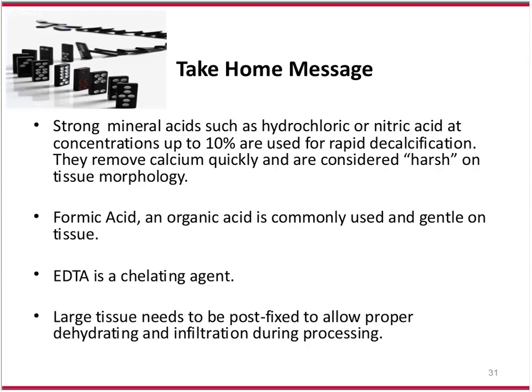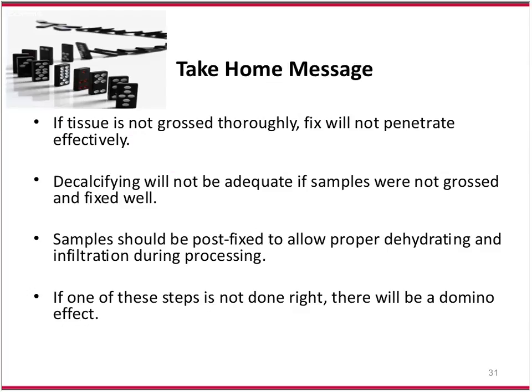Large tissue needs to be post-fixed to allow proper dehydration and infiltration during processing. I'm going to say all tissue in my lab, but in your lab you may only want to do the large tissue, or maybe you don't want to do any. I've just found that in our hands, post-fixation is a great help. If tissue is not grossed thoroughly, fix will not penetrate effectively.